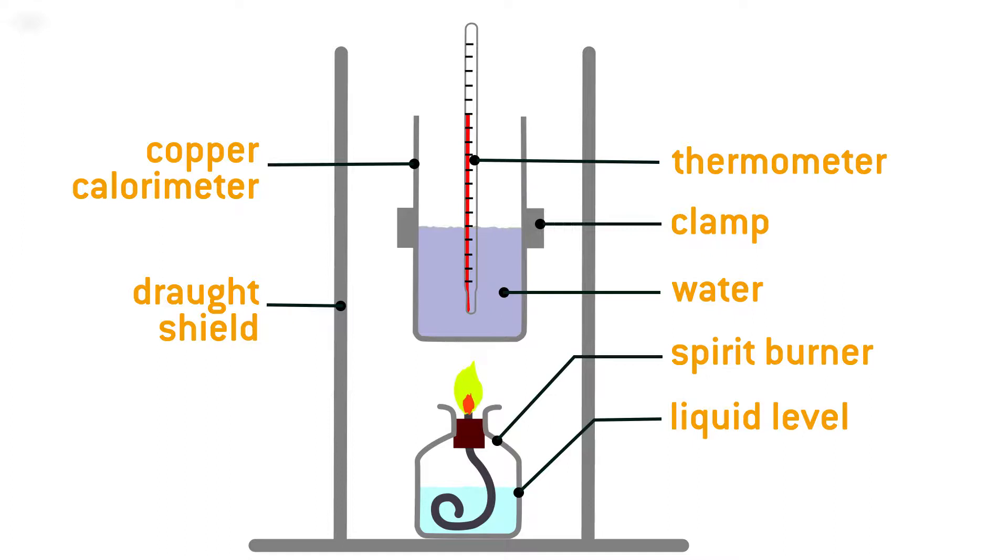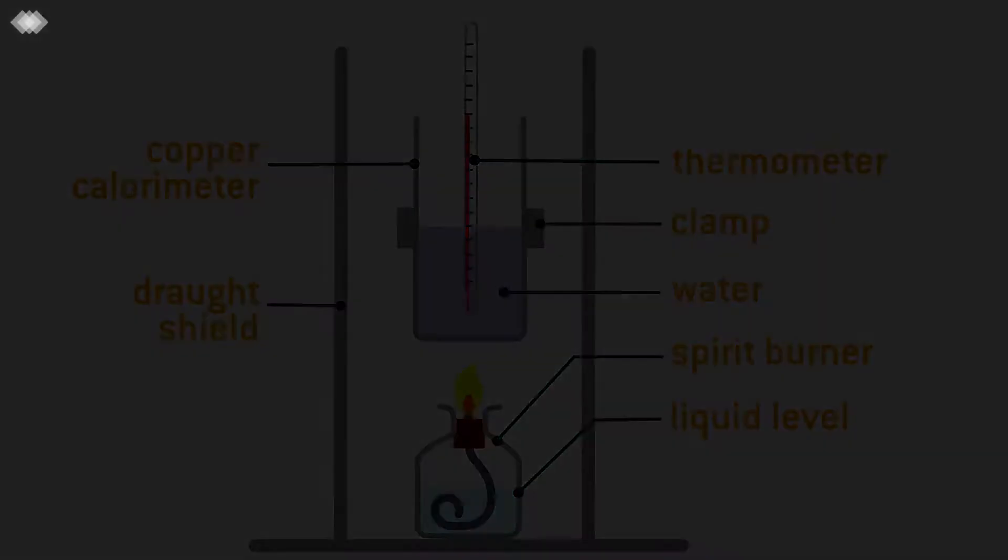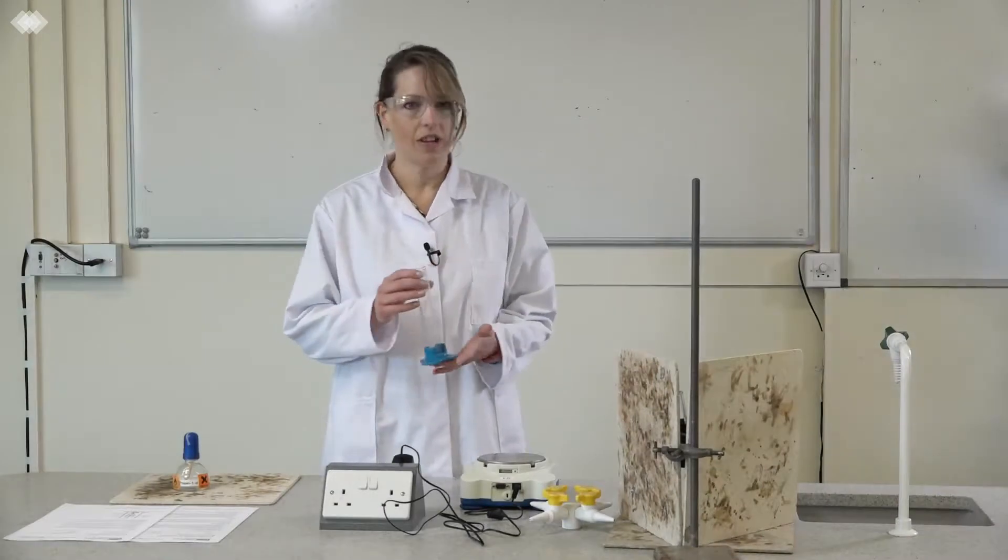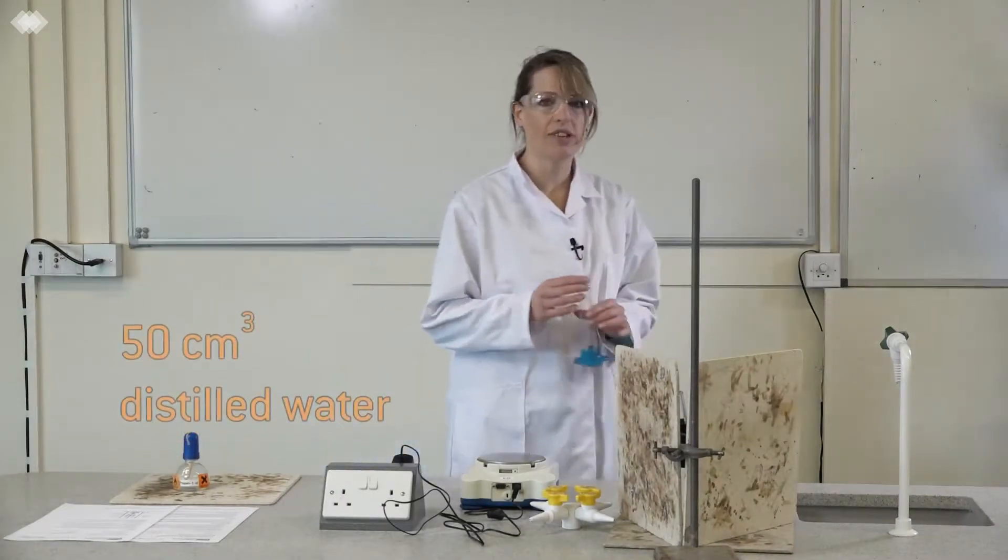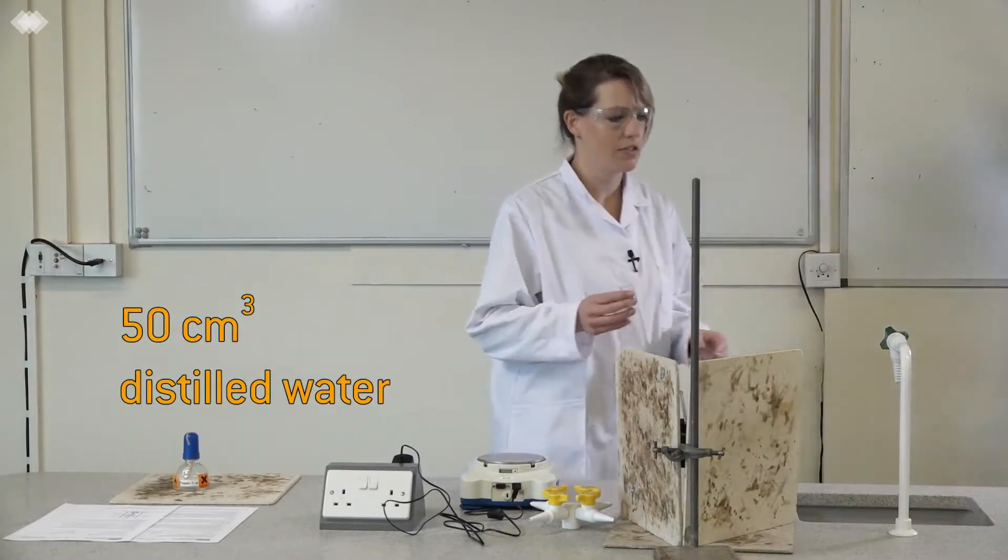To measure the enthalpy change of combustion, set up the equipment as shown here. The first thing we need to do is to measure 50 cubic centimeters of water into the measuring cylinder.